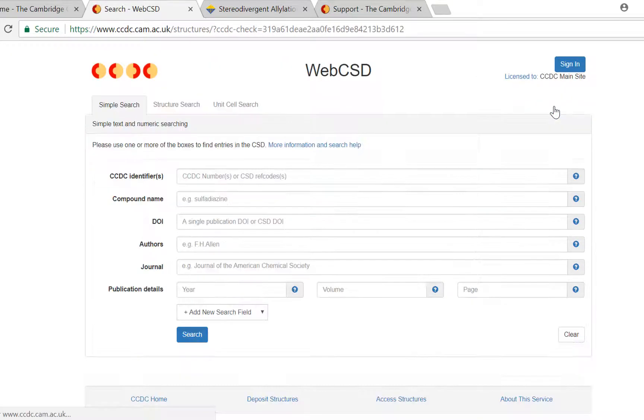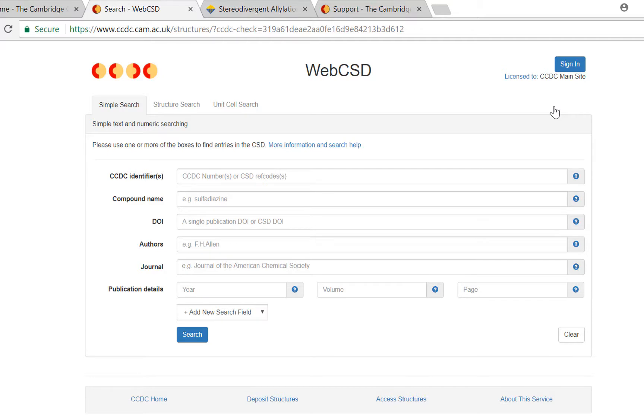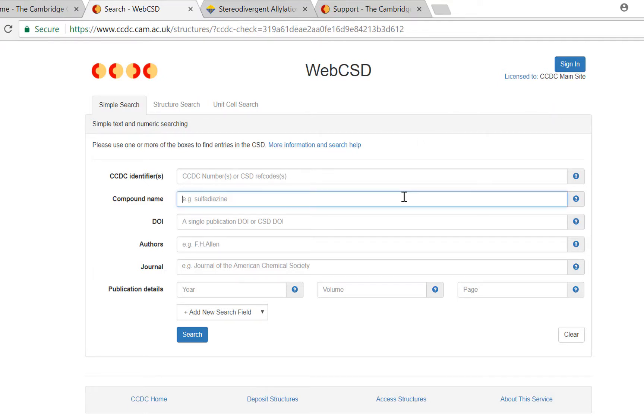Now time for an extra tip. We have created a subset of the CSD called the teaching subset. This subset contains structures we think are useful for teaching different topics of chemistry. So into the compound name search box it is possible to get results from entering the words teaching subset. So I'm going to do this now.